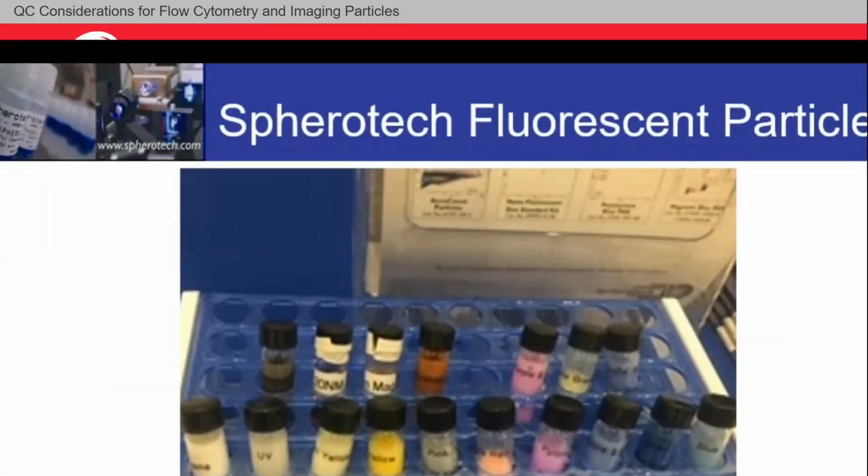This is an example of these fluorescent dyes. Sometimes people will ask us, hey, you call this yellow, but it shows up in my FITC channel. It comes off a blue laser and it appears green. Why do you call it yellow? Well, it looks yellow to the naked eye under white light.